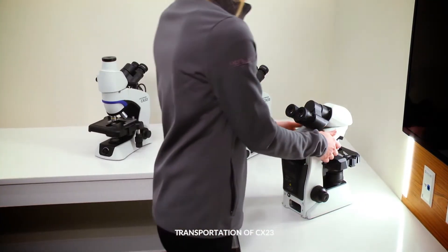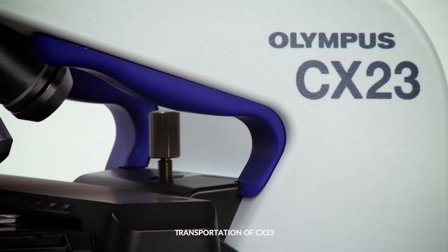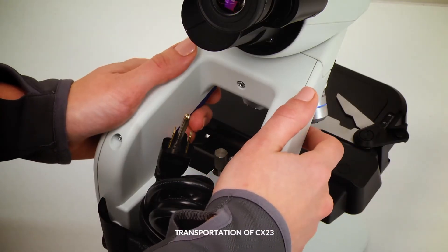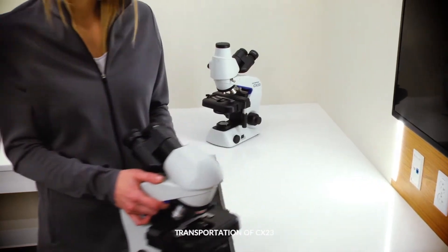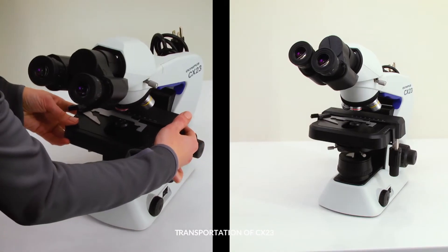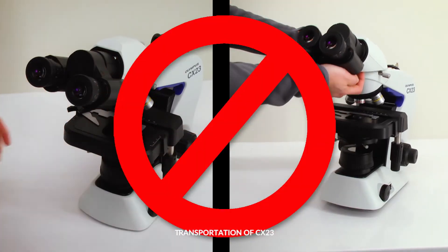When you retrieve your CX-23 microscope from its storage place, make sure that you hold it by the blue, ergonomic carrying grips. They help make transporting the microscope easier and more secure. Never carry it by the stage or observation tube, as this may damage the microscope.